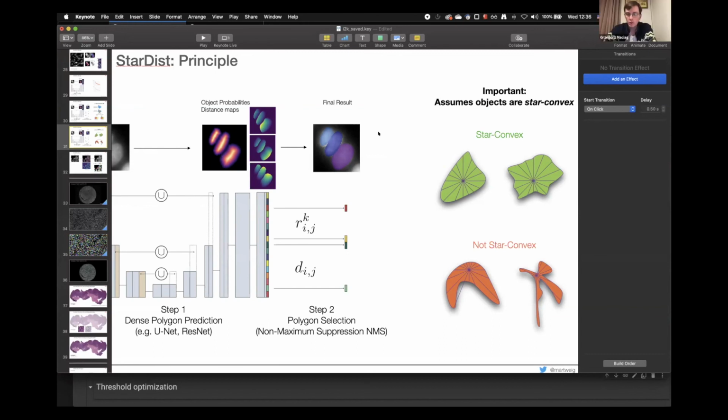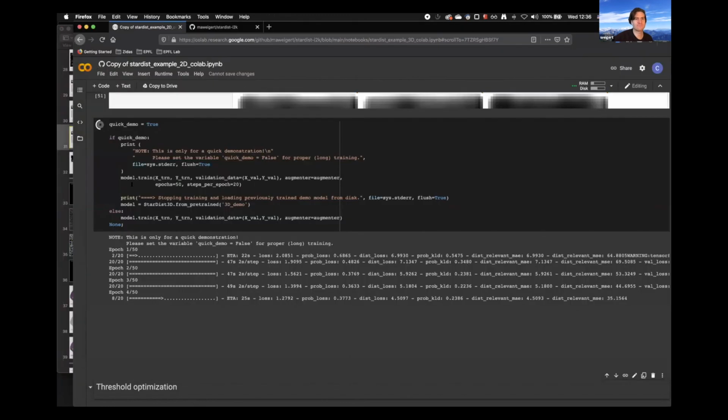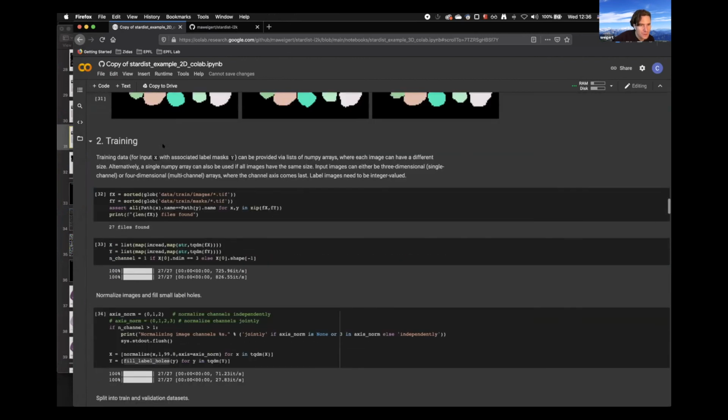I have a question. Yes. So with this pipeline, if we have multiple channels, will it just work on all the channels? Yes, it will just use all the channels. You have to make sure that if you save it as TIFF, the channel should be the last dimension of the array if you load it in Python, but you can always reshape it, of course, in Fiji or wherever you want.